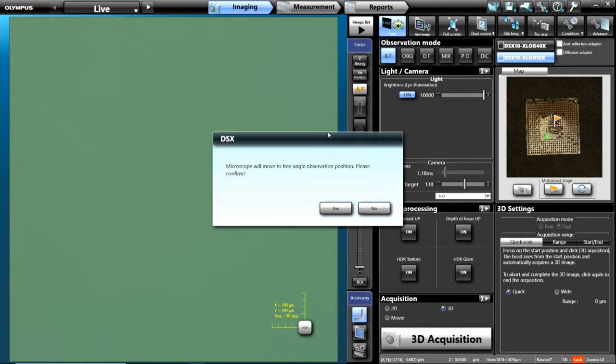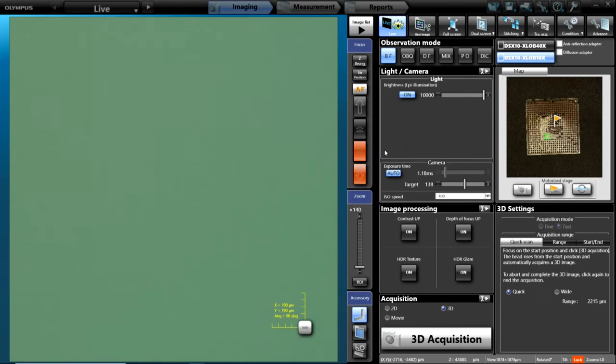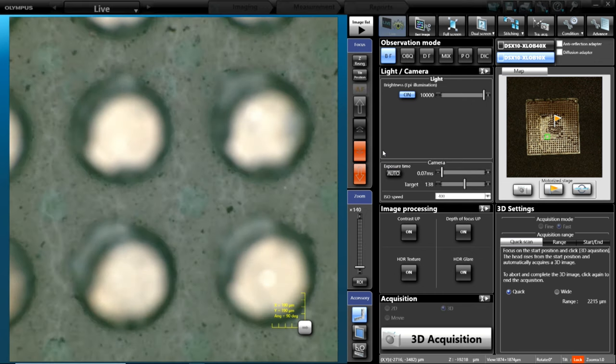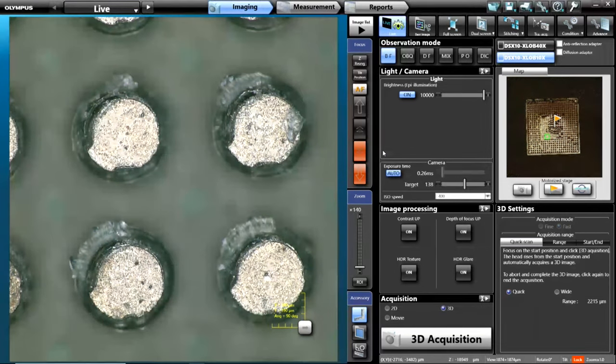All the lenses are parfocal, so all I have to do is go to a tilt position. My 10x objective will drive down to the same focus point to where I can just hit the autofocus button, and it'll find focus on the pins again. Same field of view, my same four pins, but I'm seeing a little bit more contrast and a little more resolution out of this objective.